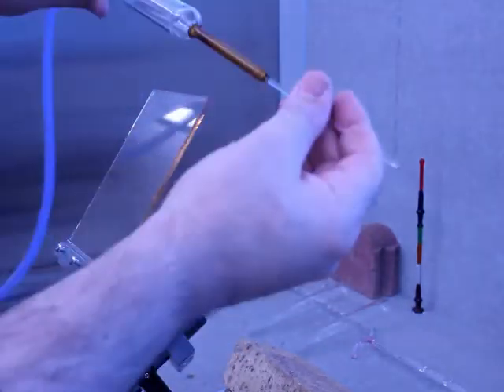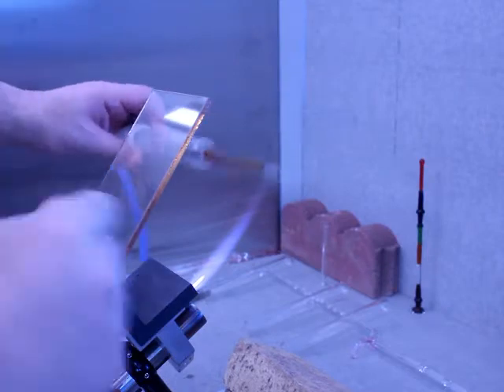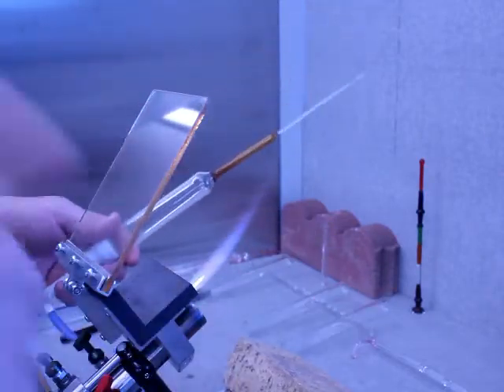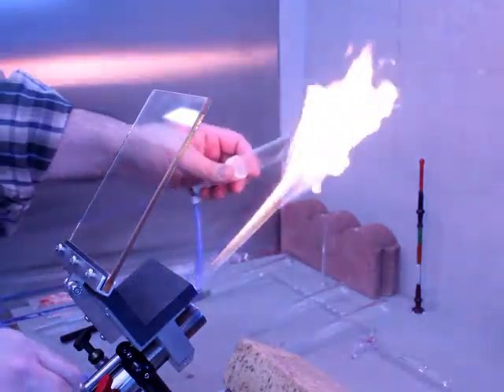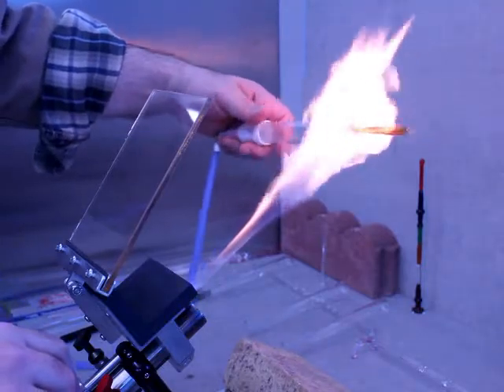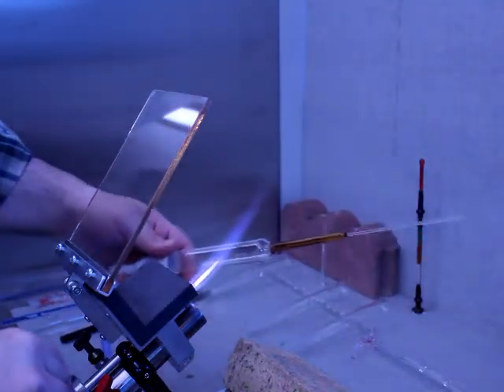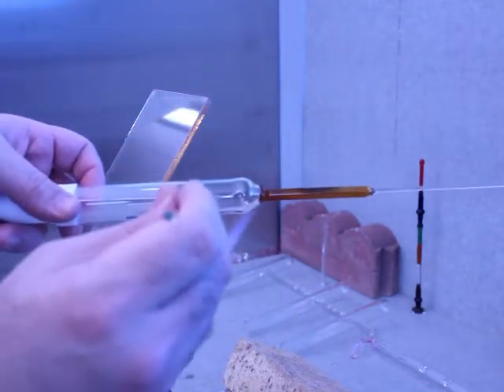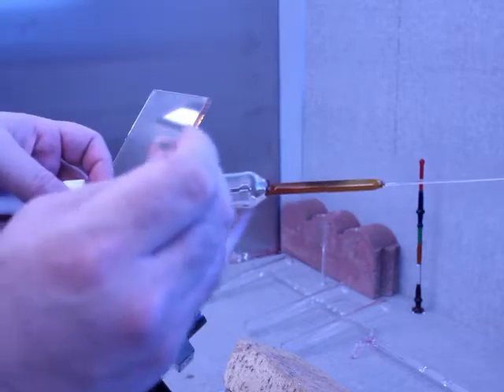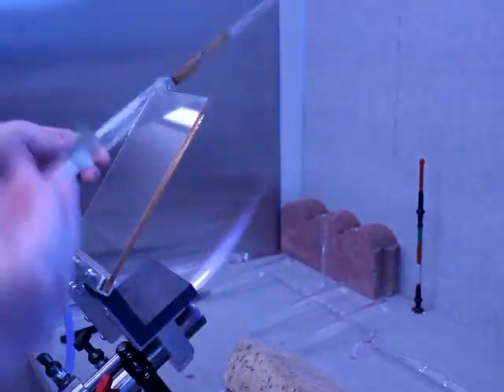Now, normally if this was just the straight seal that I was trying to work on for the project, I would go in and clean this up. But I'm not going to do this. I want to make sure that it's got a proper weld on it, that it's not going to break on me. In fact, I'll give it a little bit of a torch anneal. And I do mean a little bit, just a few seconds, and that'll be fine. And the reason why is I'm going to let this cool. I'm going to pop a hole for the outlet about here, and then I'm going to bridge these two pieces of glass together, and then with the hand torch clean up both of the seals.